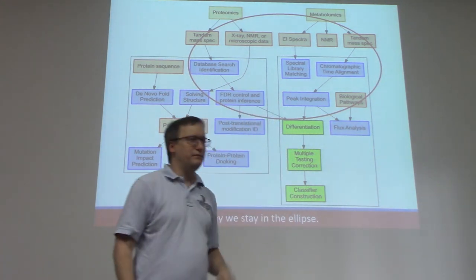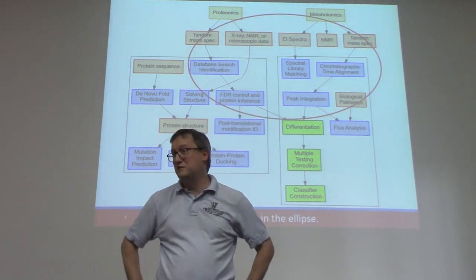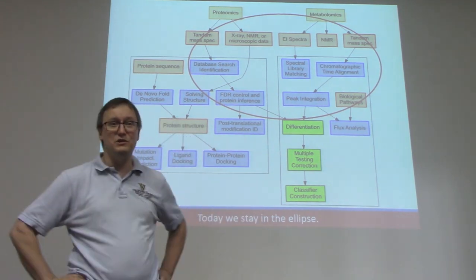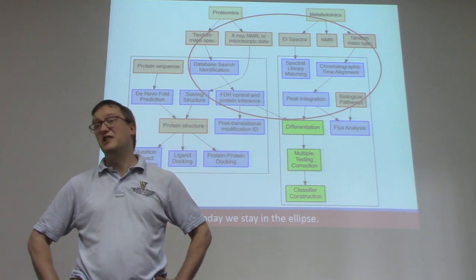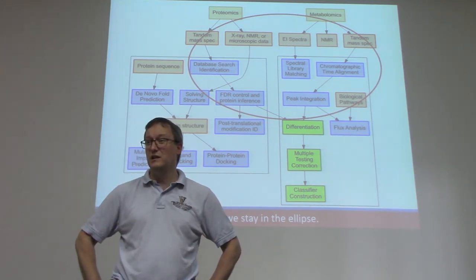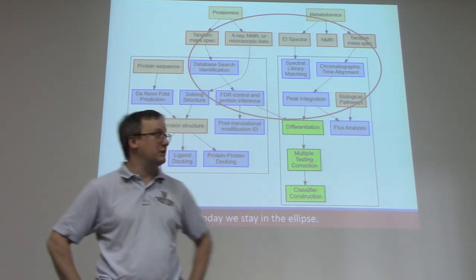So we've been talking an awful lot about sequencers, and today we are stepping away from sequencers altogether. Instead, we're talking about peptides, and in the case of metabolomics, non-peptides, things that we can separate by some sort of chromatography and analyze by mass spectrometry.